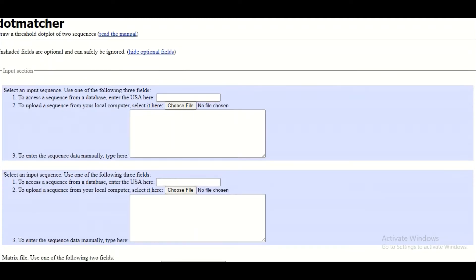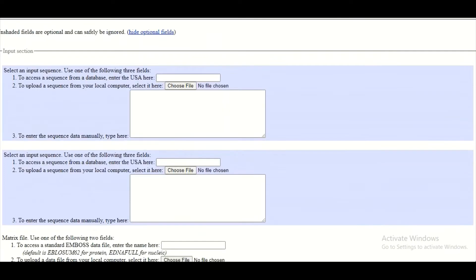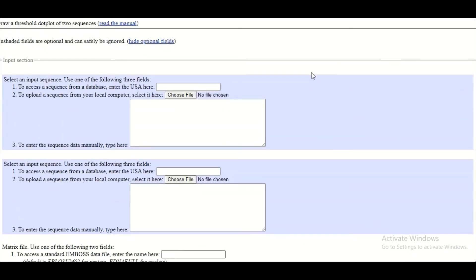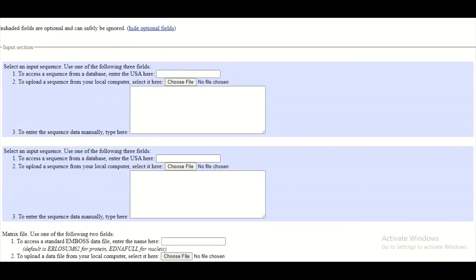Here on this dot matcher page you can find the spaces where you can copy and paste your sequences. Alternatively, you can upload the sequence files here and then these sequences will be compared with one another. So let's begin that comparison.